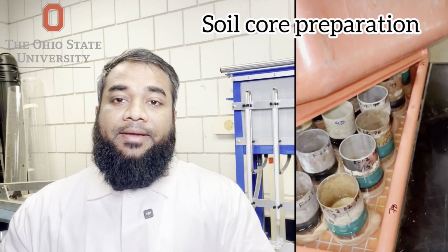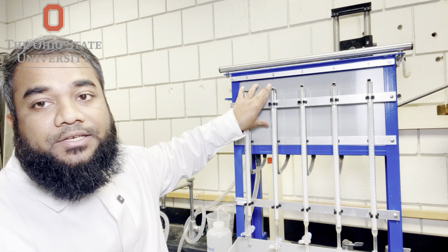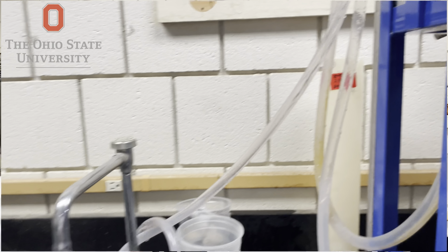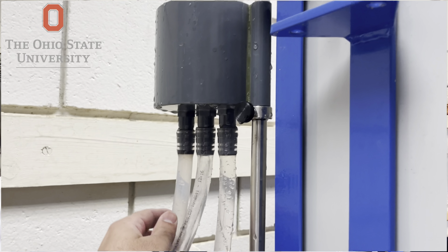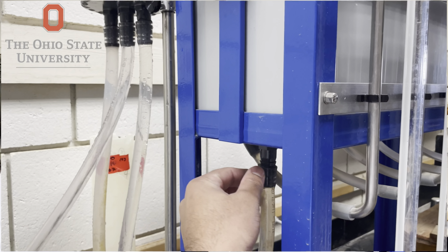Then the next step is constant head setup. Here is the apparatus you can see. Now we will set up the constant head permeameter. This setup includes a water reservoir. Here is the water reservoir you can see. An inlet tubing supplying water to the soil core. These are the inlet tubing. A fixed water head maintained above the soil surface.